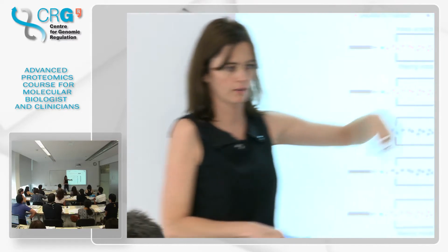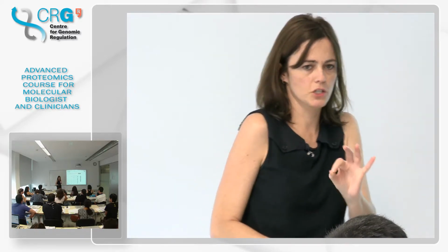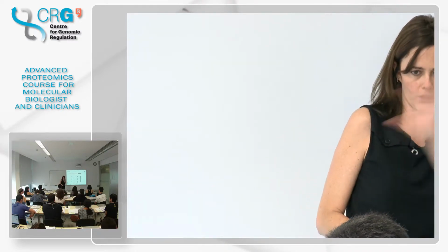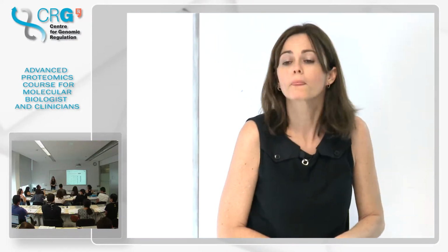Yes, but you lose sensitivity depending on how many transitions you measure. There is a number of transitions that you can measure. You cannot measure infinite transitions, and this all depends on your cycle time. We are going to see this, because this is a very, very important point. So you need to understand the cycle time. Okay, so any question on the cycle time?